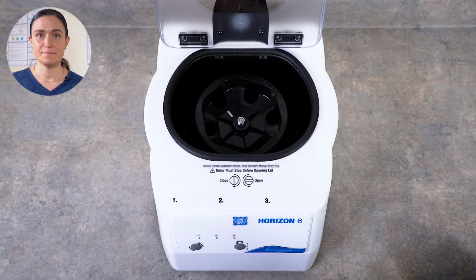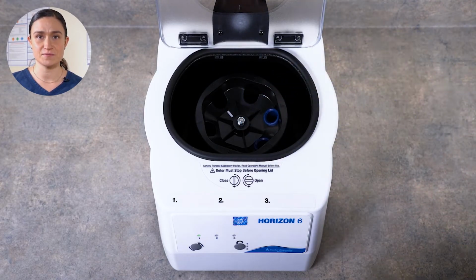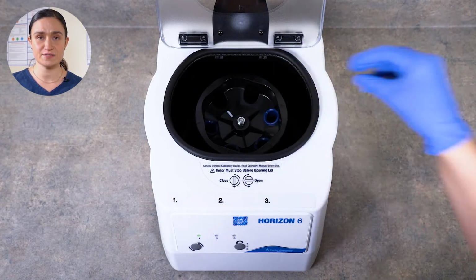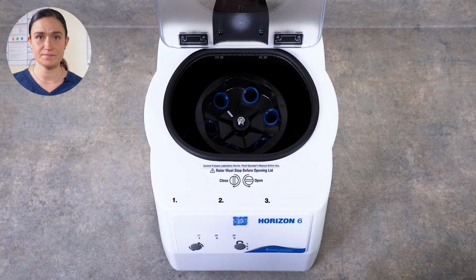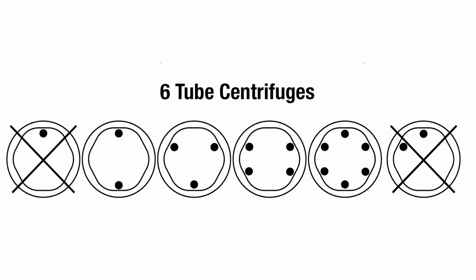Step 1. Make sure that all 6 tube holders are properly seated in the Horizon 6 rotor. They do not snap into place, but should be seated 1 per slot in the rotor. Step 2. Load your samples. When loading your samples, opposing tube holders must be of equal weight, as shown in the diagram on your screen.